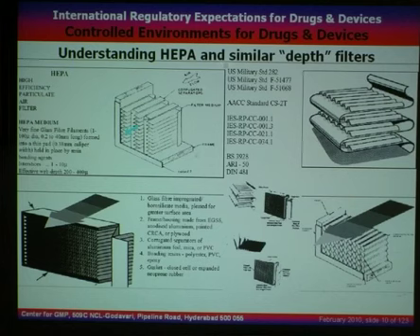Now let's look at some of its characteristics. High efficiency particulate air filter or arrestor, very fine glass fiber filaments, 1 to 100 microns diameter, 0.2 to 40 mm long, formed into a thin pad, 0.38 caliper, held in place by resin bonding agents, and the interstitial space is 1 to 10 microns, and the effective web depth could be 200 to 400 microns.